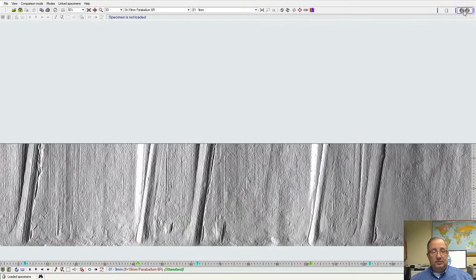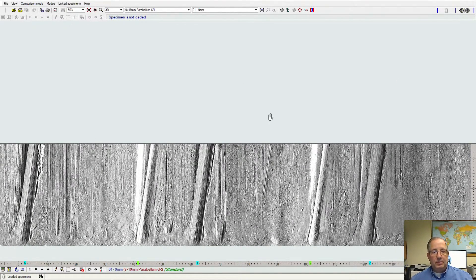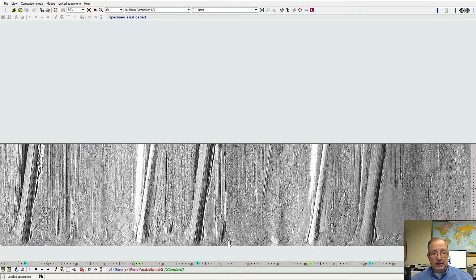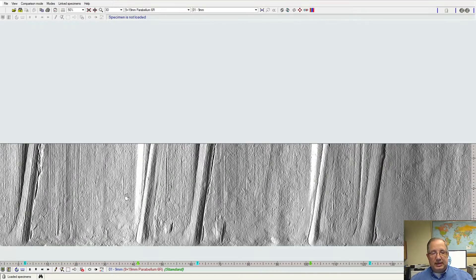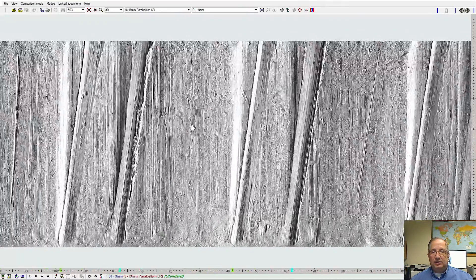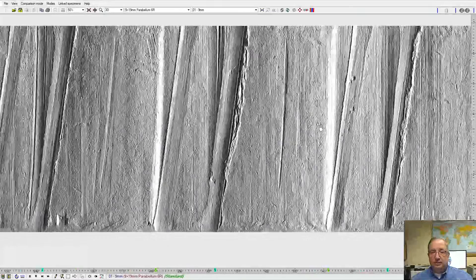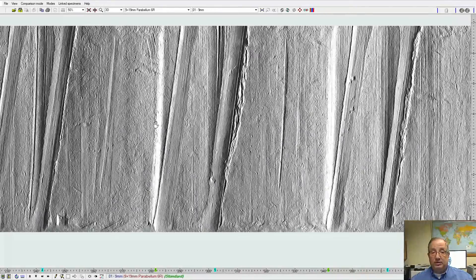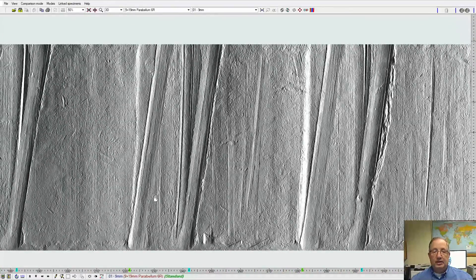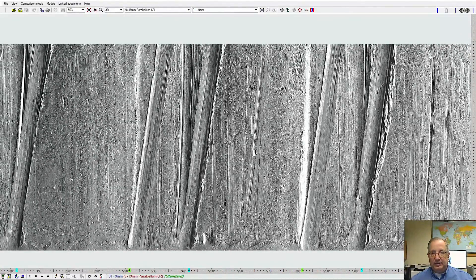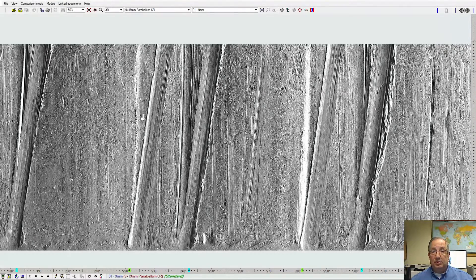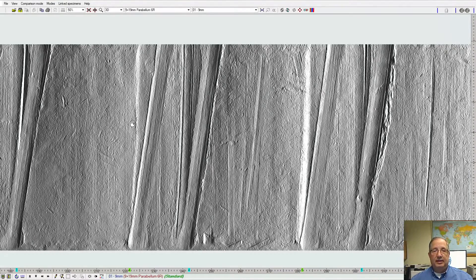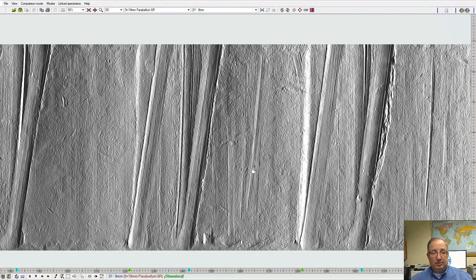Now here we are looking at the side of a 9mm sample that has traditional rifling, been scanned in the system, and again, I can use this as just a single microscope image or a virtual microscope image of the sample that we have. Here we can see our land engraved areas, our grooves, or our slippage marks cleanly engraved on the bearing surface of this bullet.